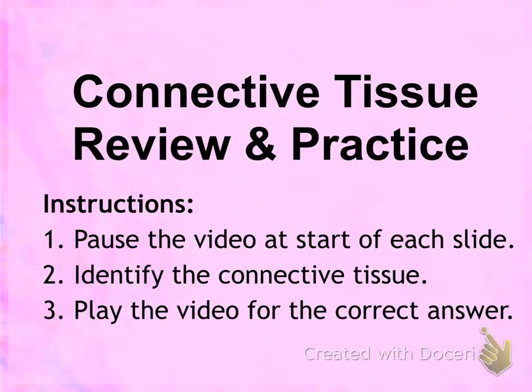This is connective tissue review and practice. The instructions are at the beginning of the slide: pause the video, try to identify the tissue, then afterwards play the video to check your answers.